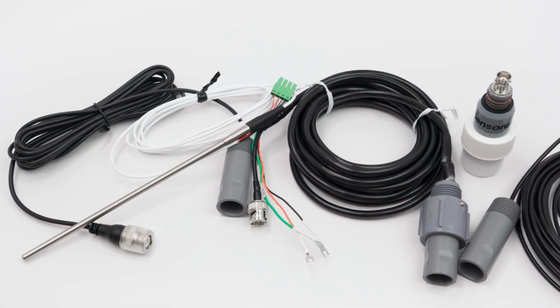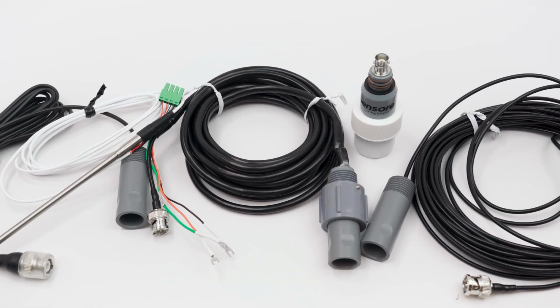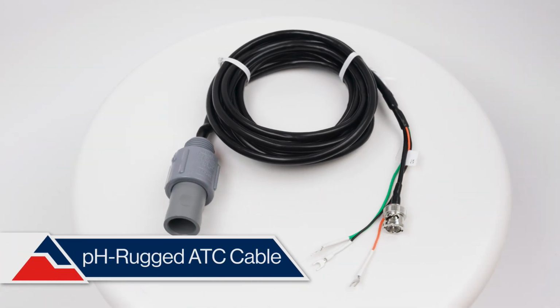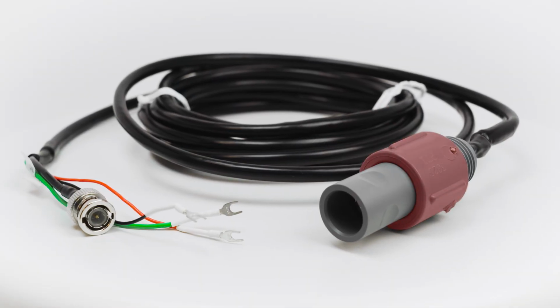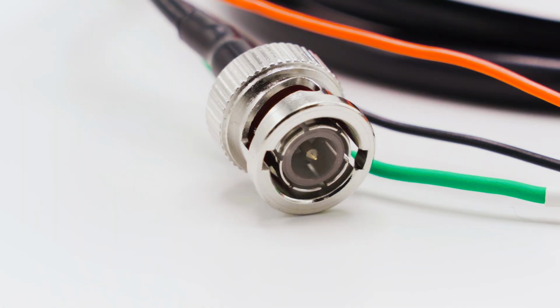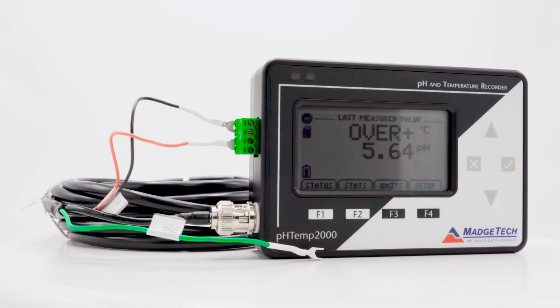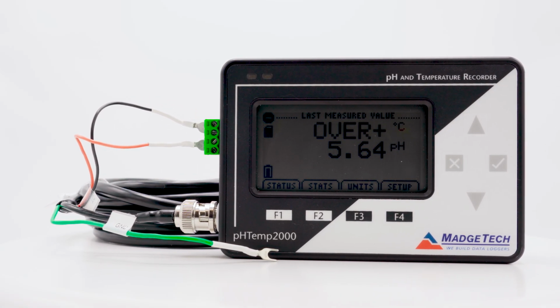For use with the pHTemp2000, a cable assembly and RTD reference is required, and 2 mounting assembly options are available. The first and simplest mounting assembly option would be the pH rugged ATC cable, which features a built-in RTD probe providing automatic temperature compensation. The 3 extra leads coming from the pH rugged ATC cable carry the signal from the built-in RTD probe to the pHTemp2000, meaning no extra probes are needed to get an accurate reading from your pH rugged electrode.